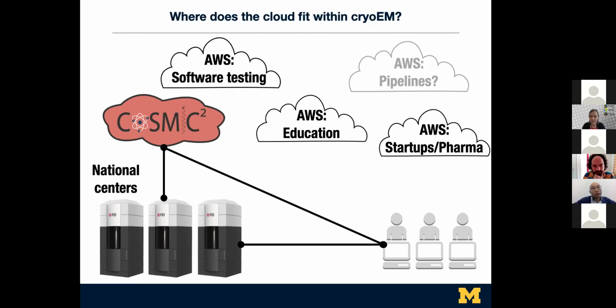All our trainees that are remote have used AWS tools to do computing, from CryoSPARC to RELION, et cetera. So that's where it's useful. Afterwards, the researcher has more information on whether on-prem versus cloud is useful for them, and they can make that balance. It's not a zero-sum game. You can use both, and in this case, we use both.